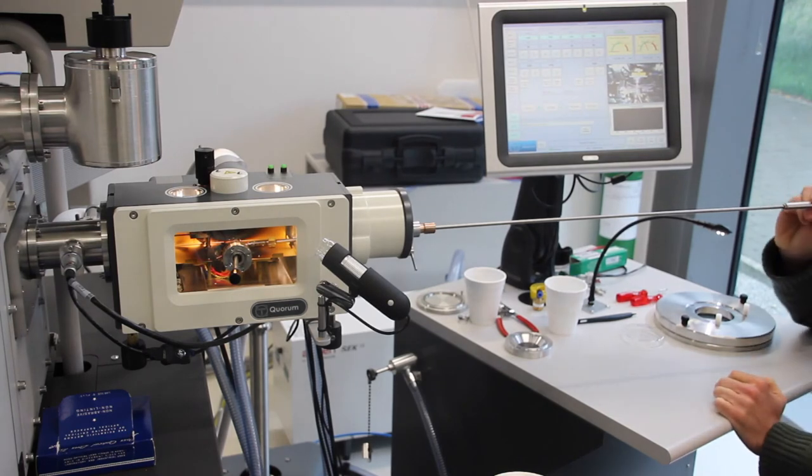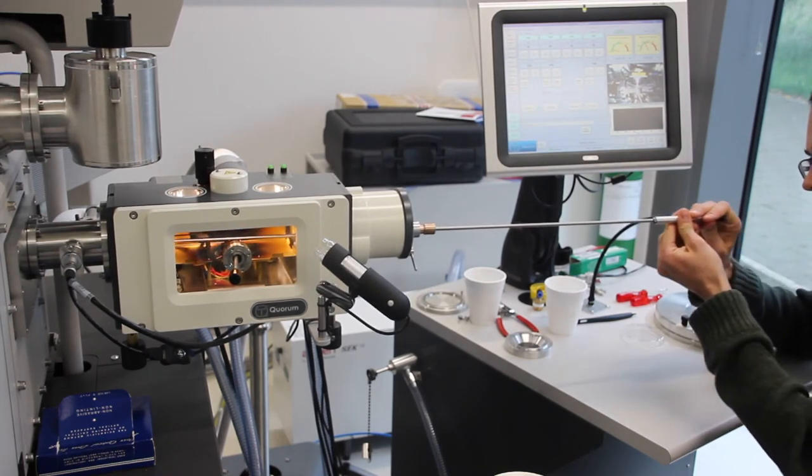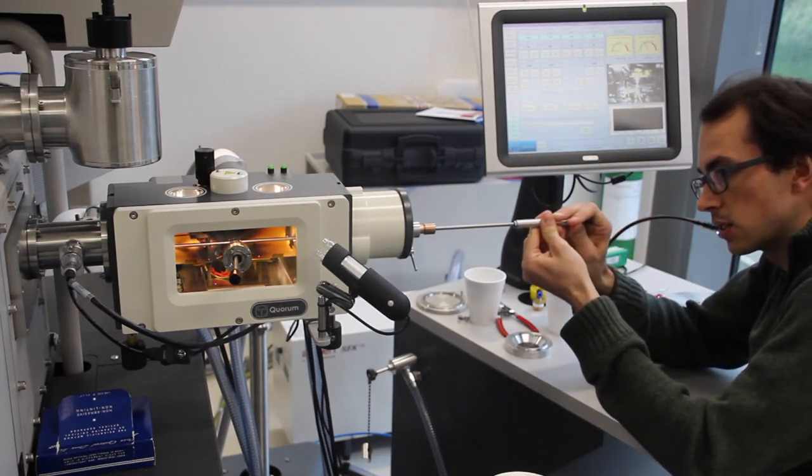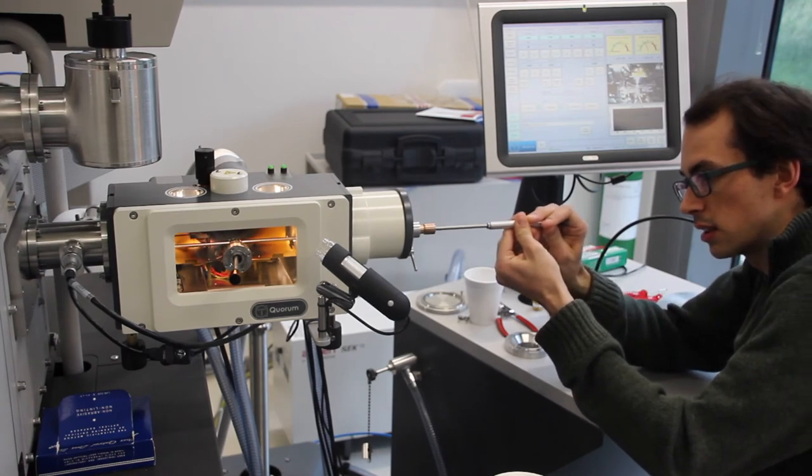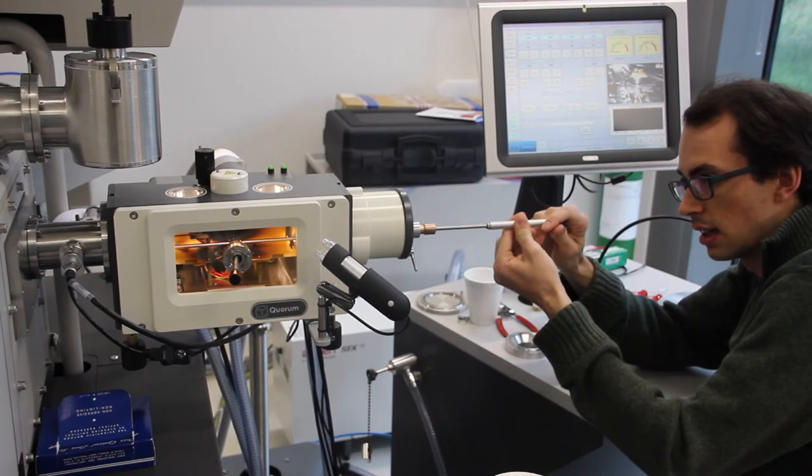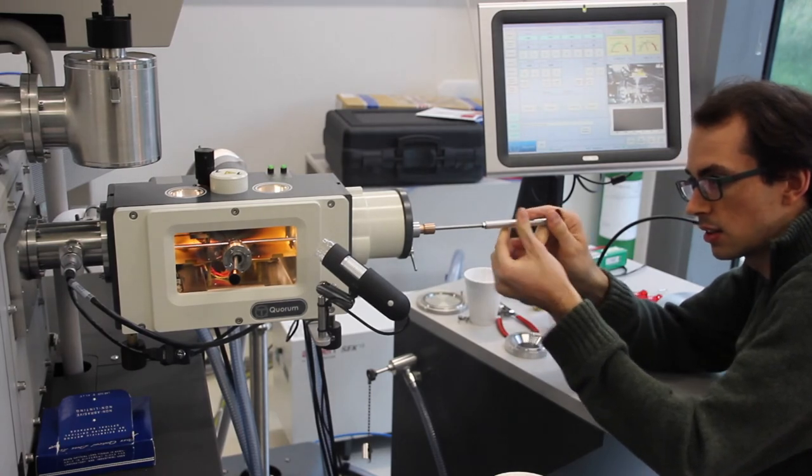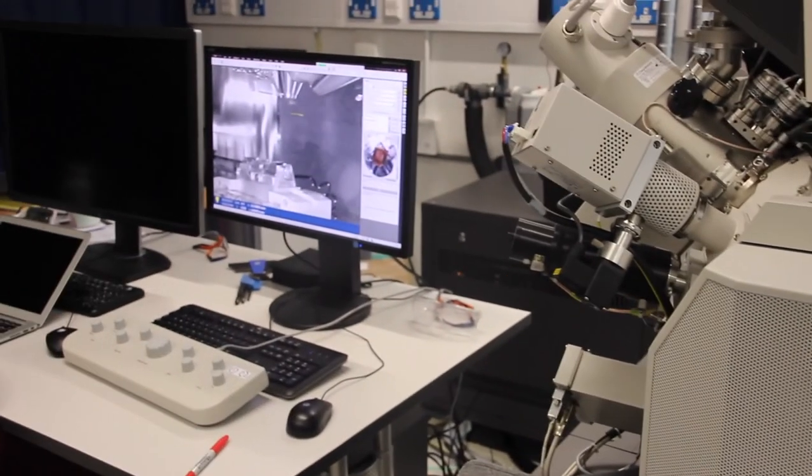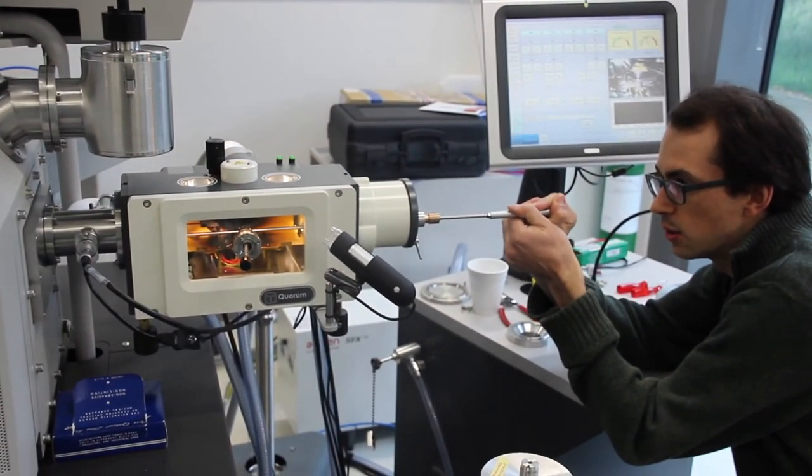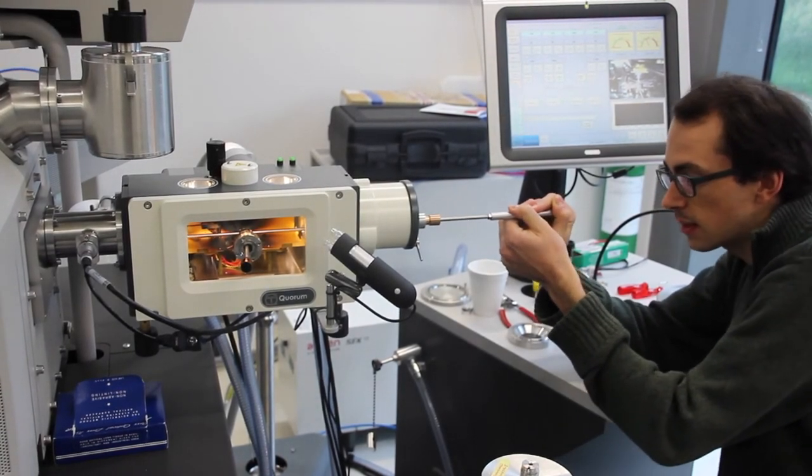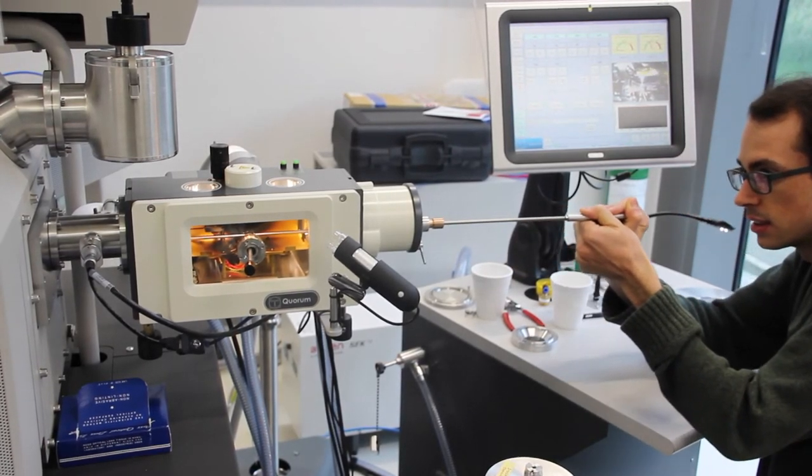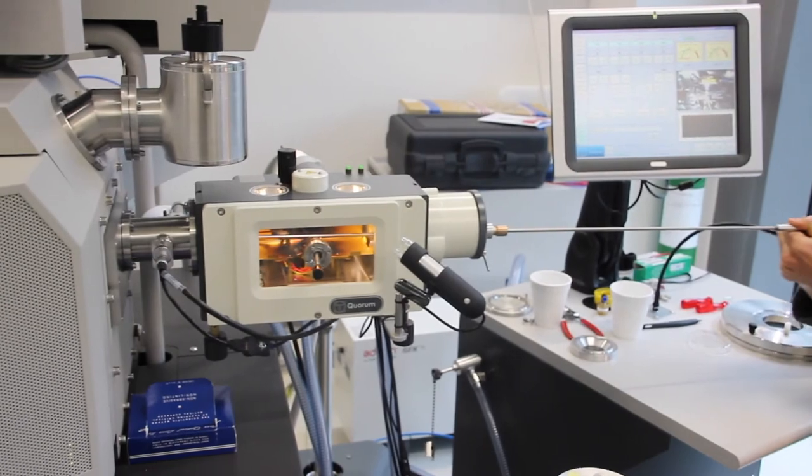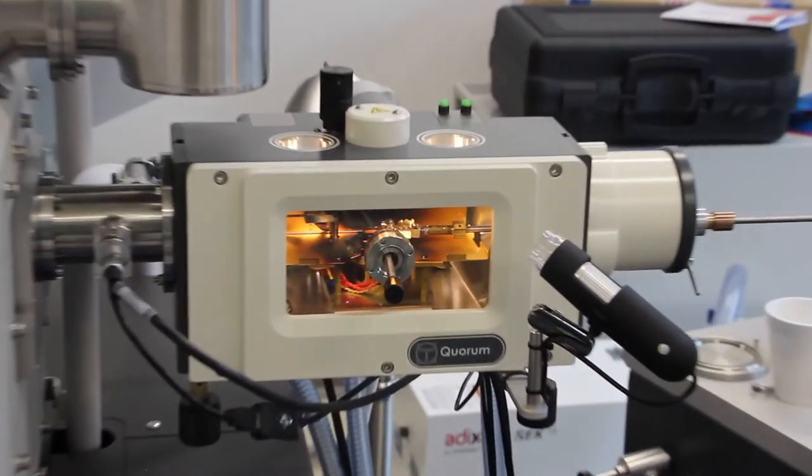We will take the rod and insert it all the way to your sample near the shuttle. Make sure that the holes line up with the holes on the shuttle, so keeping it like this, zero degrees. Once that's in, turn 90 degrees. You can double check on the computer if the rod is in on the sample, and it's also a good idea then to just test it and make sure that when you pull, the sample moves, the shuttle moves as well as one. Once you're confident you have it, you can pull the whole thing out, all the way to the prep stage, and place it there.